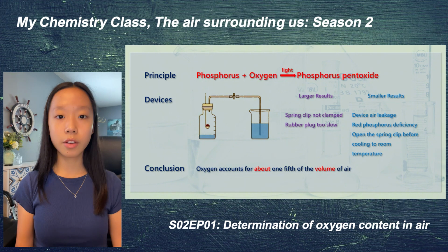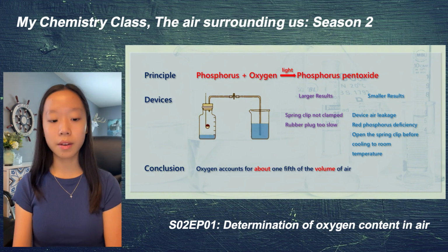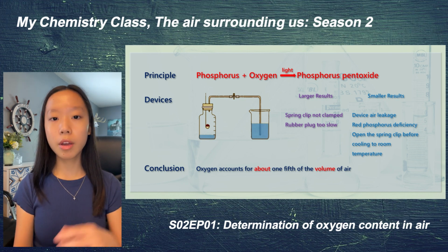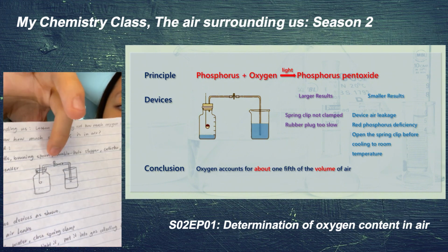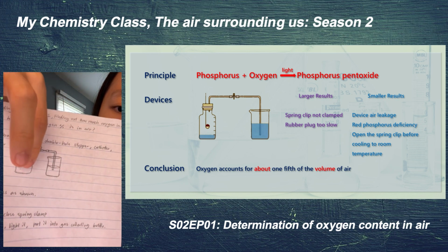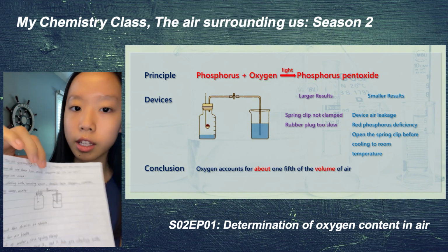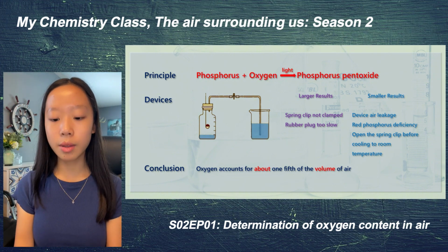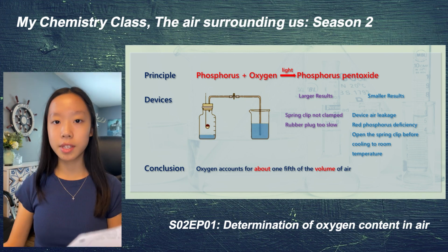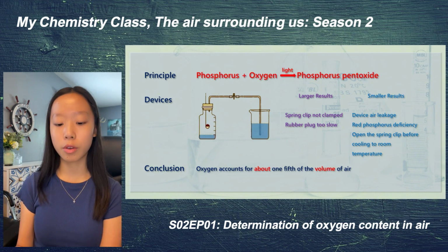We saw that the red phosphorus had a yellow flame. It produced a lot of smoke and a lot of heat. And then after the whole device cools down to room temperature, we open up the spring clamp, and then we will see that the water flowed up the tube and into the gas collecting jar, and it's about 1/5 of the gas collecting jar, which means that the water is about 1/5 of the original gas volume. And that gives us the conclusion, which is that oxygen is about 1/5 of air's volume.